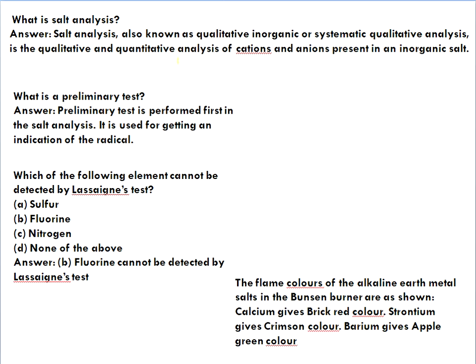What is salt analysis? Salt analysis means analysis of cations and anions present in an inorganic salt. There are two types of analysis: quantitative analysis and qualitative analysis. This is a qualitative type of analysis.